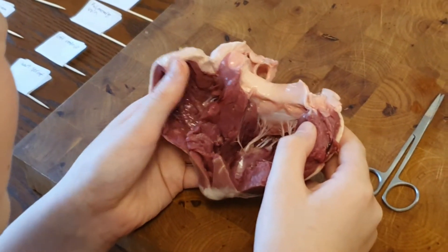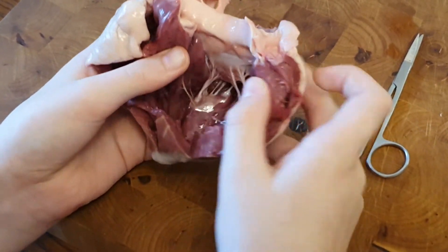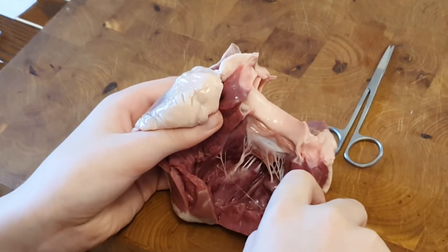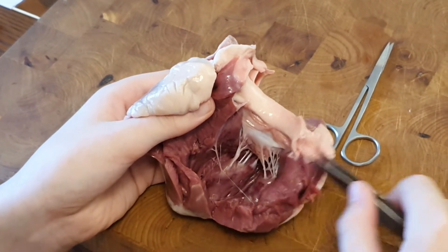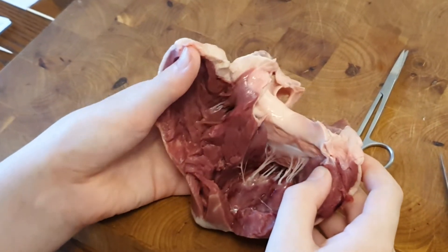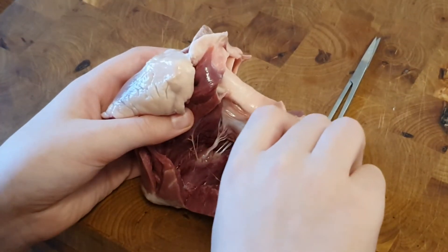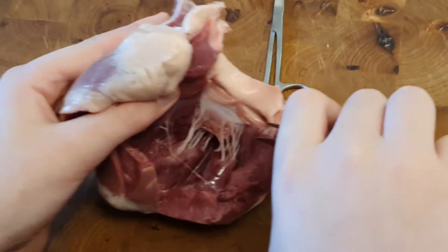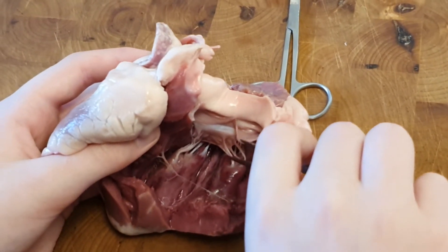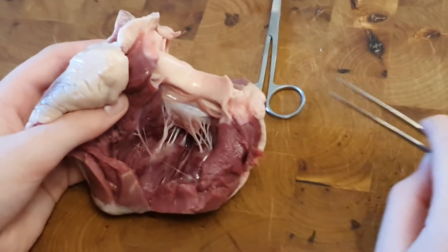We have cut further into the heart and exposed the heart strings, which are those white things there. The heart strings are for protecting the heart so it doesn't get inverted. Up here there are a lot of these — these are semilunar valves that stop the blood from going back, from flowing the wrong way.